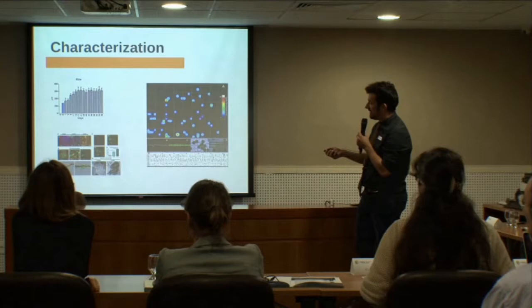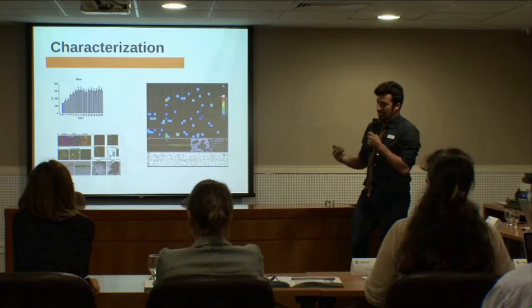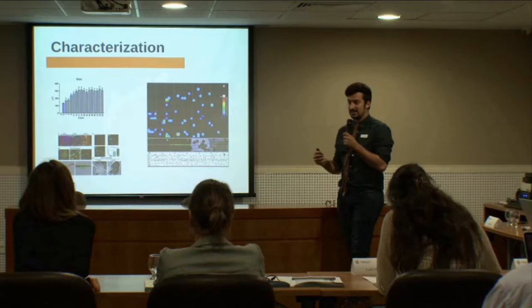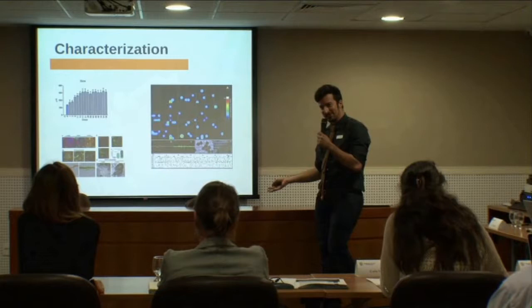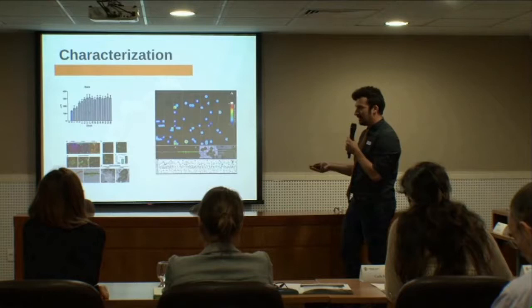And this is really important because organoids that are bigger than 500 microns sometimes get a necrotic center. And the necrotic centers, for some research, are not important, but for toxicology, it's really important because if you have cells that are dying, you are not going to know if it's because of the toxic or because of your model, right? So we were really trying to get something that will be useful for our purpose.